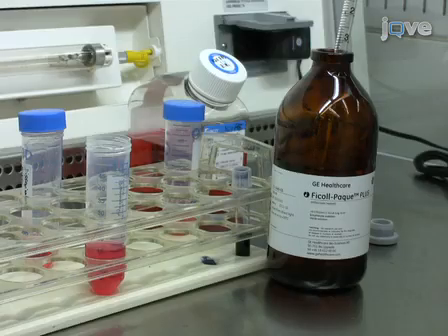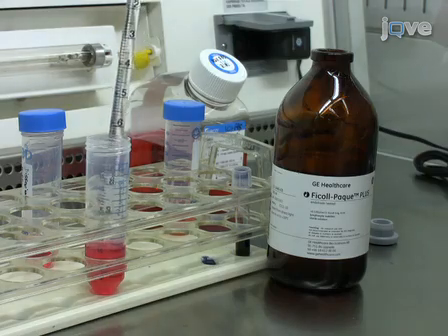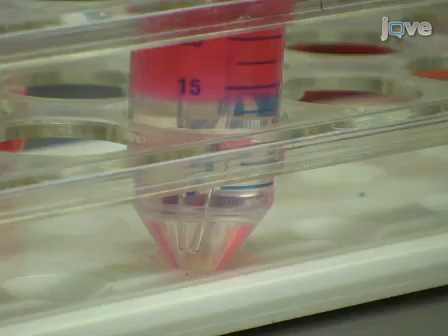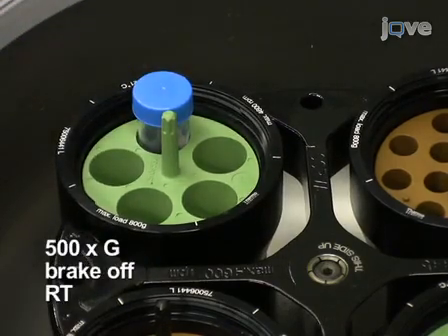To further separate viable cells from dead cells and tissue debris, pipette 15 milliliters of Ficoll-Paque Plus slowly below the cell suspension to prepare a Ficoll gradient for separation by density centrifugation. Take care not to mix the 2 layers. Centrifuge at 500 G for 30 minutes at room temperature with the brake turned off.